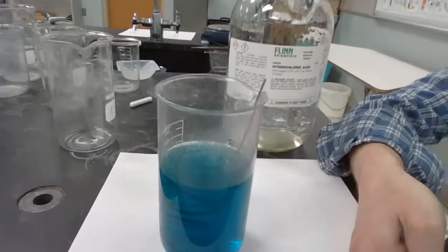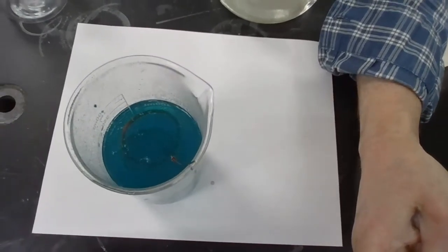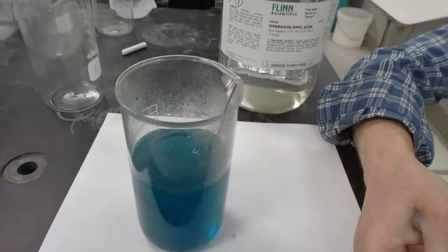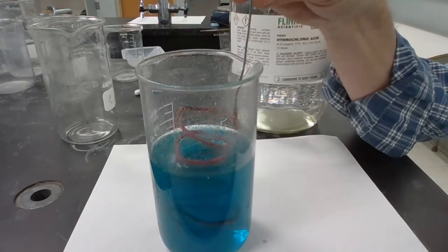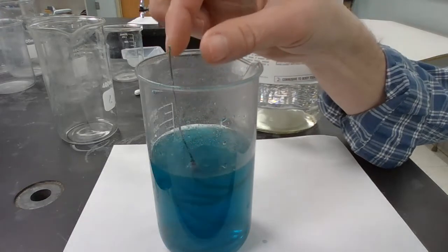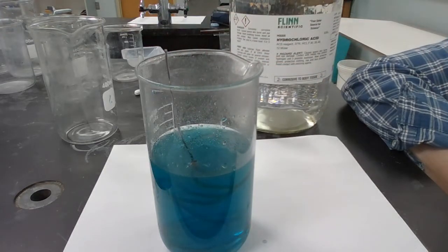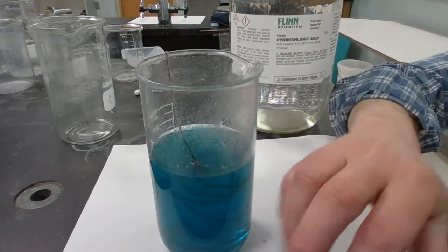All right, so we're still getting lots of bubbling. It's getting there. We'll let her go a little bit. Our wire's getting kind of brownish. So we may know already that that brown stuff is copper. So copper's coming out. We're also getting hydrogen gas that's coming out of solution. And so still got a little reacting to do. We'll let her go to the end.